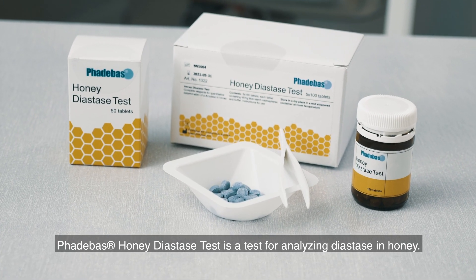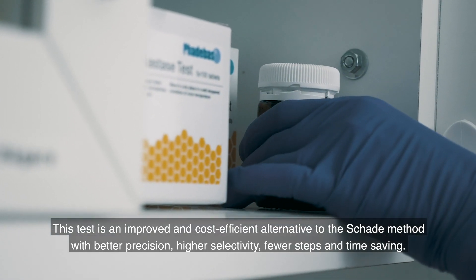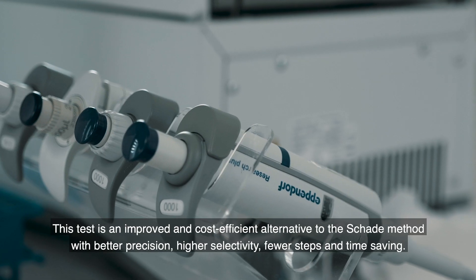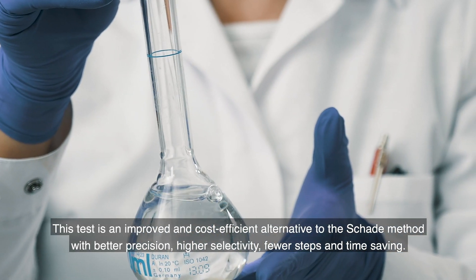Phadebas honey diastase test is a test for analyzing diastase in honey. This test is an improved and cost-efficient alternative to the Schade method with better precision, higher selectivity, fewer steps and time-saving.